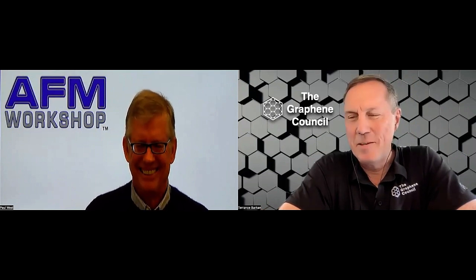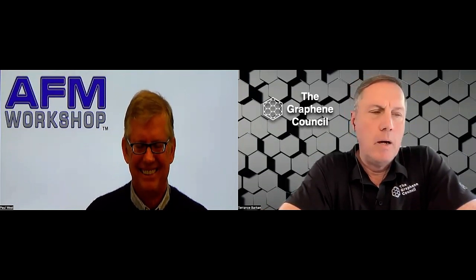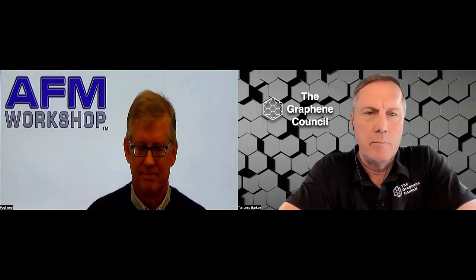I hear you. That makes perfect sense. AFM has often been viewed as an excellent technique, but it's also viewed, at least this is what I hear, as relatively slow and relatively expensive. For many of the graphene companies, concerned about quality control, I don't know of any that are using AFM because of those reasons. But you mentioned this equipment is under $50,000 for a unit. Can you talk a little bit about, from sample prep to imaging to processing, what kind of time frame are we typically talking about?